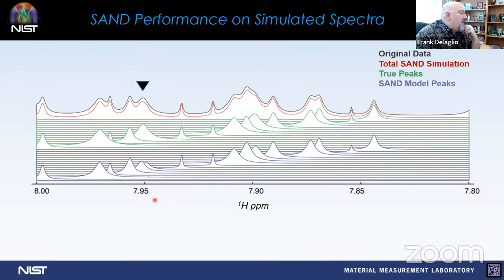And one of the challenges with this kind of work is that for a very complicated spectrum, there might not actually be enough statistical information to make an unambiguous decision about whether a particular region is 1 signal or 2 signals or 3 signals.